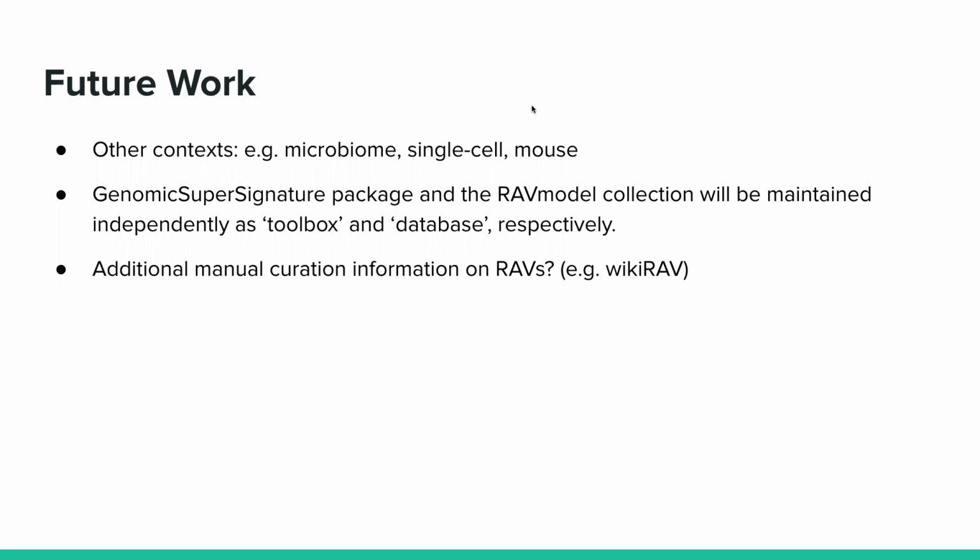Right. So the first part, yes, that's already there. You can take something like that neutrophil RAV, or all of the RAVs, and just calculate them in your data set so that you have a RAVs by samples matrix. So if you want to estimate neutrophil count in your data set, you just use that same RAV and it's done, even on a single sample level. So there's no principal components analysis in your data set.